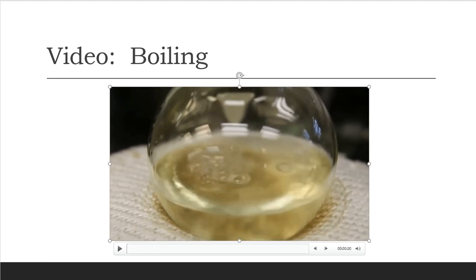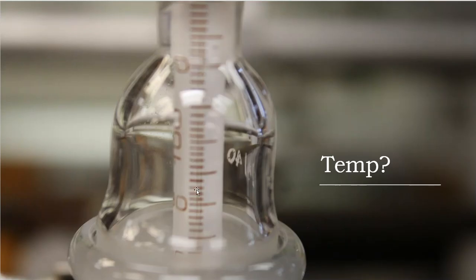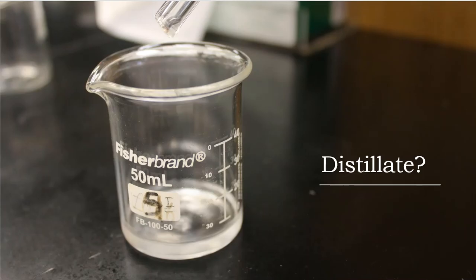Okay, so there in that visual, you saw things that began to boil. So I took a look at my thermometer again, and what do I see? Oh, nothing. What a shame. Well, that means that that vapor hasn't hit that thermometer yet. So I need to give it a little bit more time before I start to see things begin to come over. However, I do see a little bit of distillate. My thermometer is lagging behind, and my distillate is very clear, which is a good sign, because if my organic solvent was THF, the cupcake molecule, that THF was a very clear, almost water-looking solvent, wasn't it?